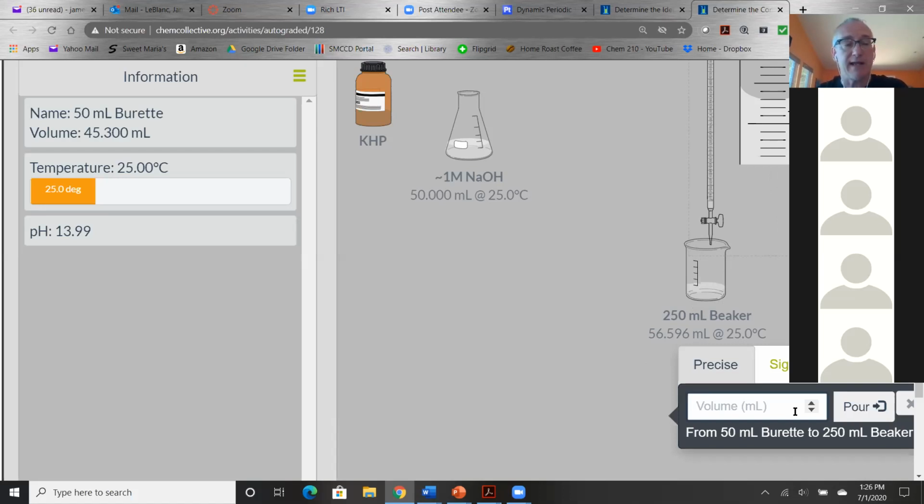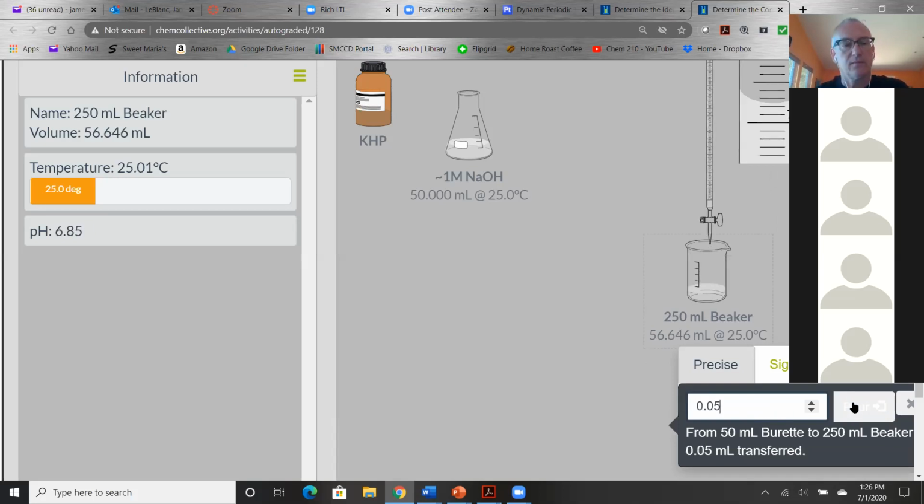Yeah, well, I'm going to see what I get. Right now, I've, okay, I'm going to pour it in there. So I'm at 6.8. I'm kind of curious to see what, so now it's still clear. 6.95. 7.09, still clear.